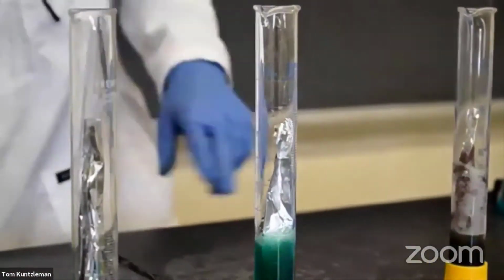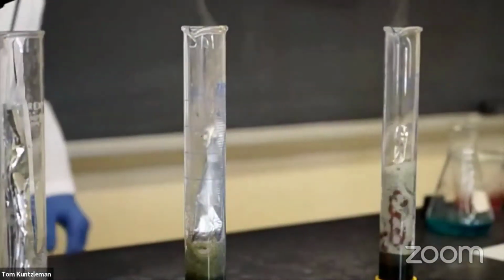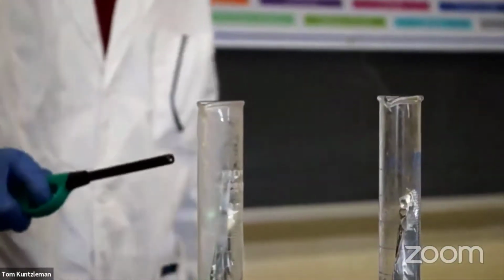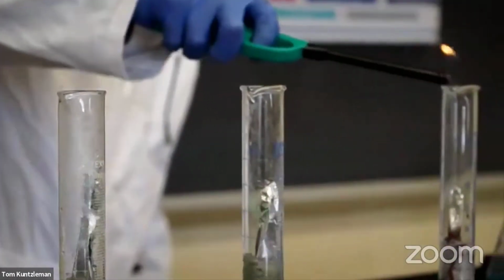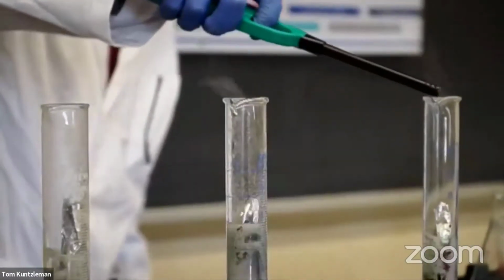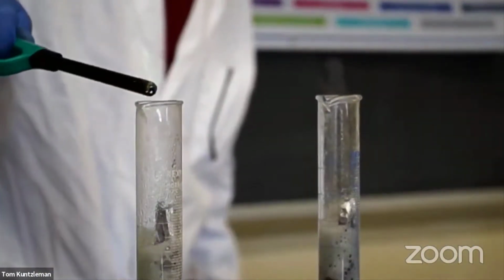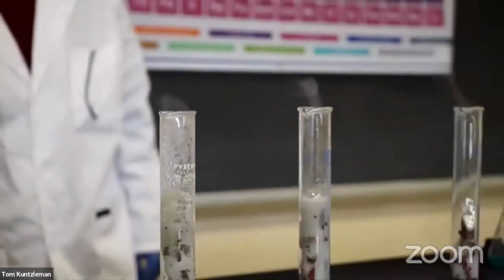Let's put this one in here. Let's get 3 of them going just for fun. Man, I see a lot of stuff going on in here. I see some bubbles. Woo, I'm seeing some green flames. We'll talk about this in a bit. Let's just play for a little while. Oh, that one seems to be running out, yeah? Beautiful green flame. Sure enough.